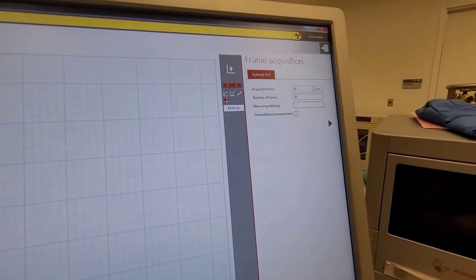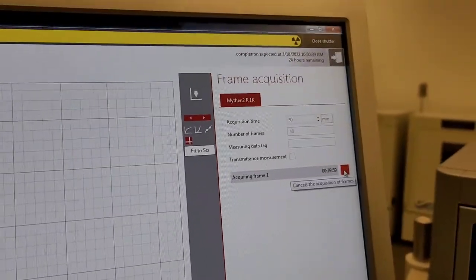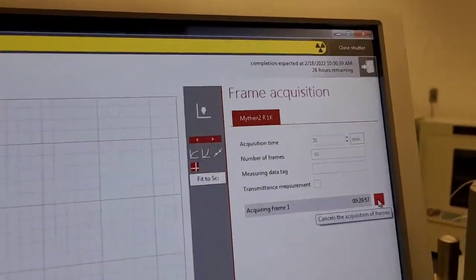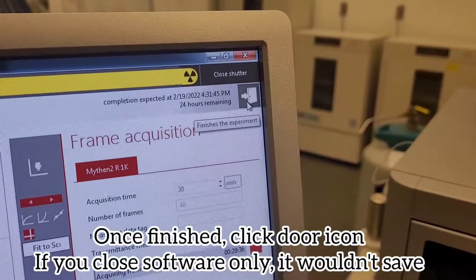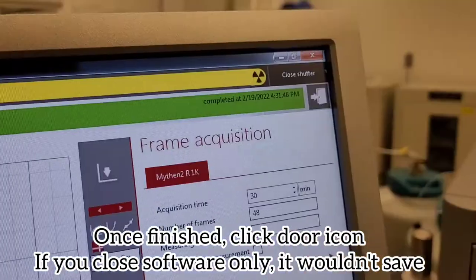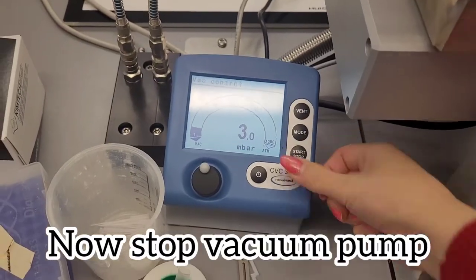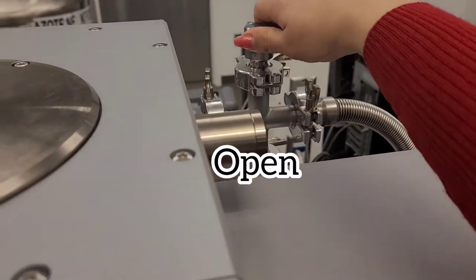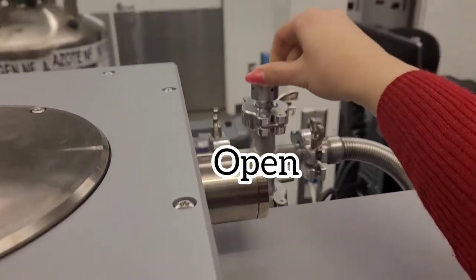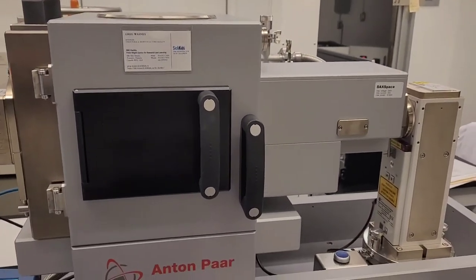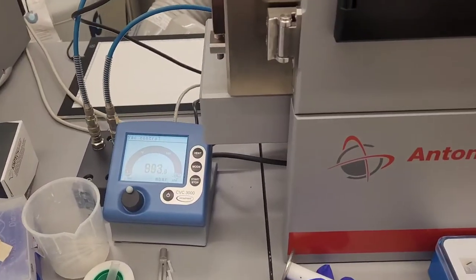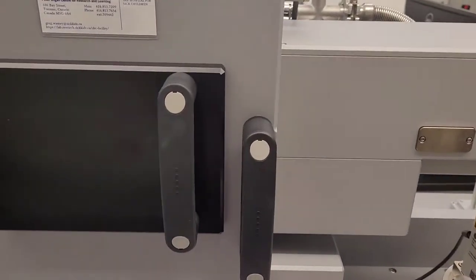The measurement was looking okay. Now I put the values that I want for my actual run, which is 30 minutes per frame and a total of 48 frames. So that would be 24 hours, which is long but this works for my sample because otherwise the data would be too noisy. But if you have a high signal to noise you can do much lower times like 2 hours. After I'm done I select the door icon. This is the only way it will save it. If you close the software it wouldn't save it.